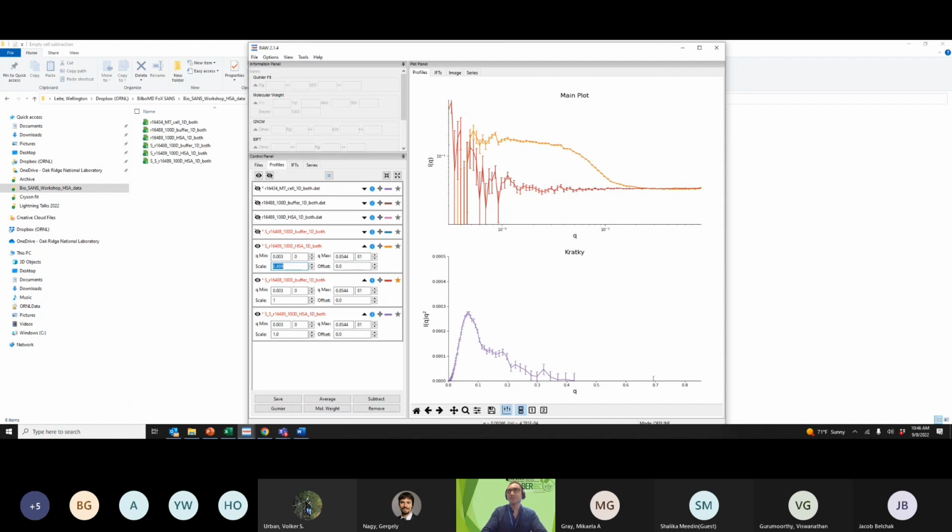That is a good question. The way that I usually do it, 10% residual looks like a number that makes sense, but it can be a little bit higher, depending on how much the mismatch was.